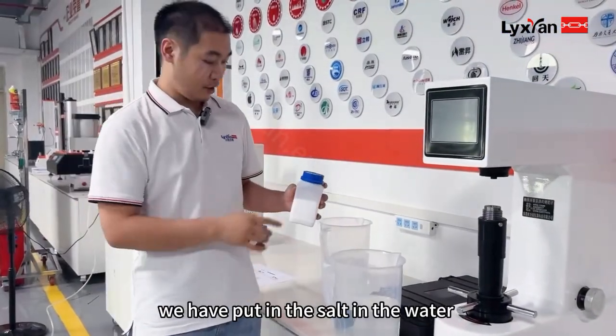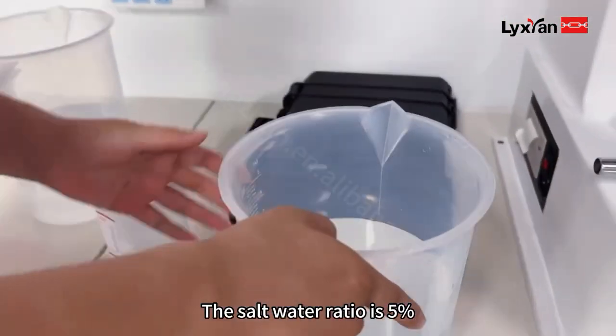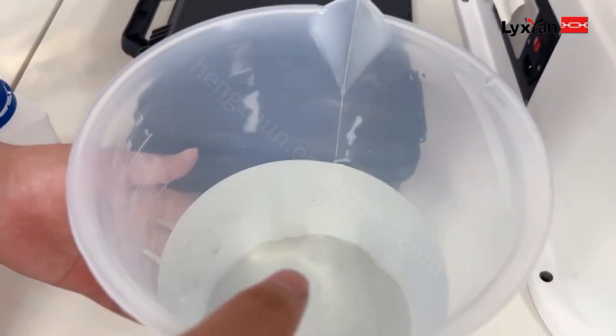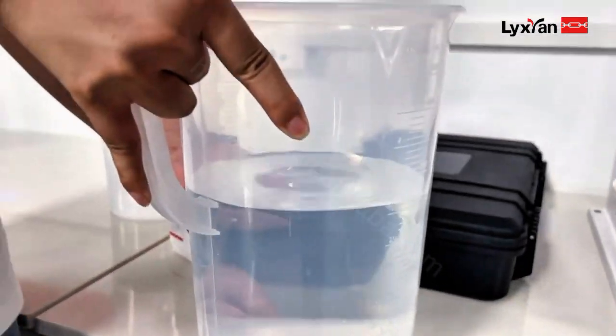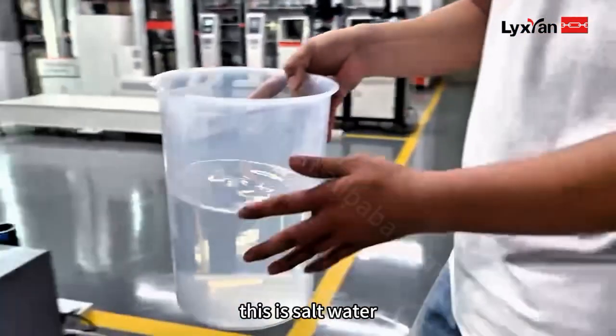Now we have to put salt in the water. The salt water ratio is 5%. This is the prepared salt water.